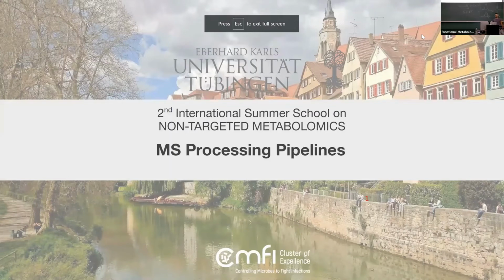Okay, so for the last session of today, we will talk a bit about MS processing pipelines and why you would need them, and how you could eventually even apply all the stuff you learned here in the summer school in a nice and complete workflow.